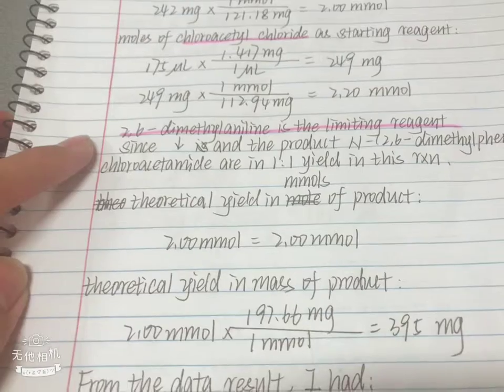Then, in the step of heating the reaction mixture on a hot plate directly, I observed the reaction mixture start to crystallize gradually, and a white precipitate crystallized out. Then I set up the vacuum filtration apparatus and collected the product, N-2,6-dimethylphenylchloroacetamide, in part 1. And here's my calculation for the result data I got.